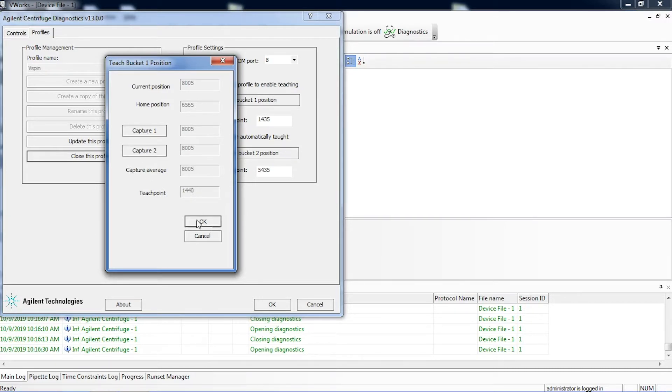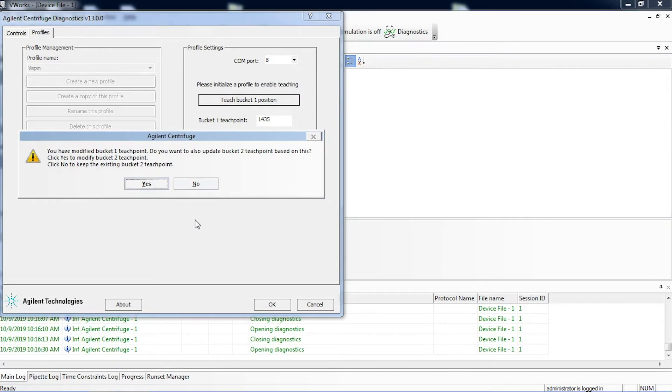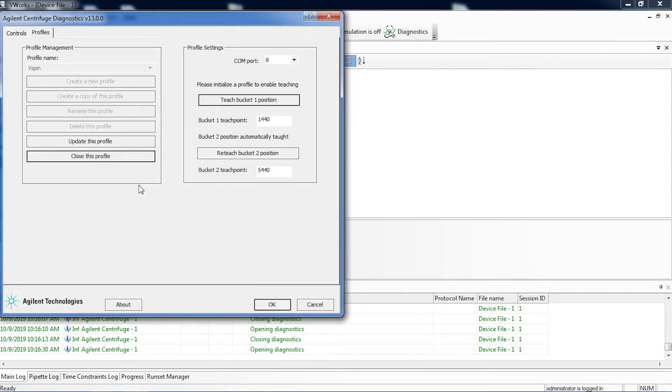Once those numbers are filled, click OK. V-Works will ask if you want to update bucket 2 as well. Click yes, and your new bucket positions will be taught.